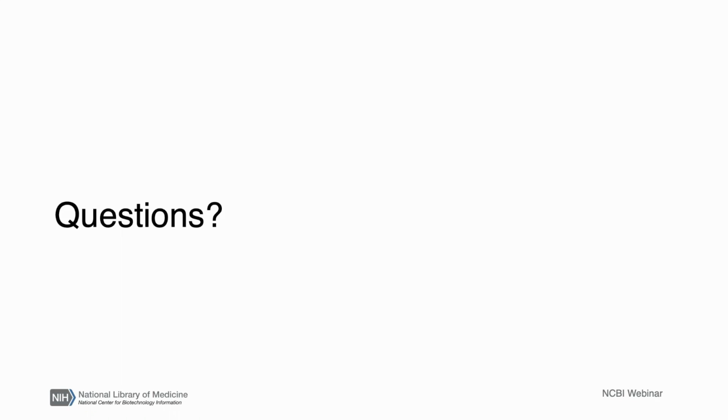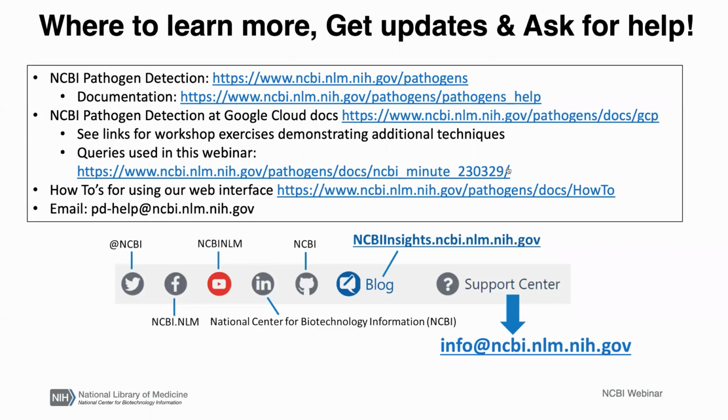Okay, and I think somebody asked about, you did show you have a web page where people can go to get the queries that you're using at BigQuery, right? Yes, I think I linked to it here. Here we are. So I put them up here, but we also have a number of other queries in our documentation. So I encourage you to check out our main Google Cloud documentation. There are many additional queries there that show you different things you can do. And of course, as I said, if you still can't figure things out, feel free to email us. Anyway, we'll share that on the FTP site that's available. Yes, I'll link to the slides that are in the chat as well.